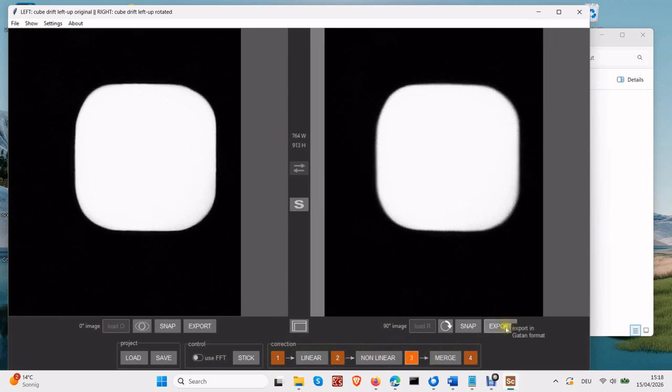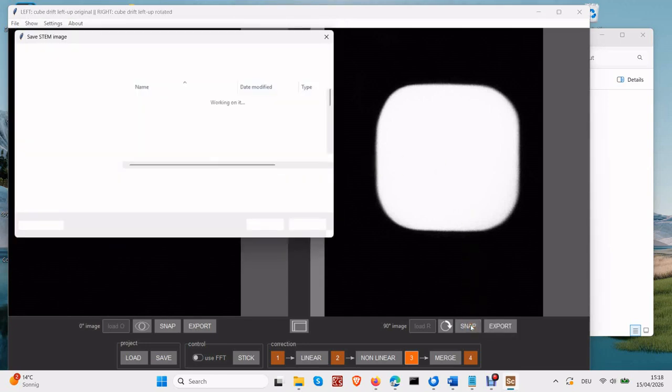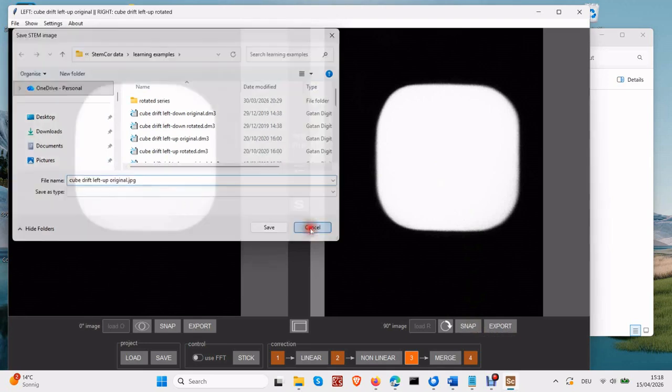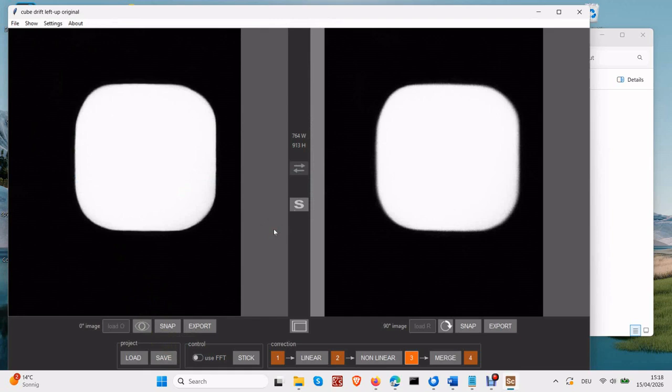You can also export any image in your preferred format. Currently, the Gatan format is selected in the settings. An even easier option is to save the display as a JPEG and paste it directly into your report. Press Snap. Finally, you might wish to save all images in a single file, intrinsic TEMDM format, in order to reopen the entire project later.